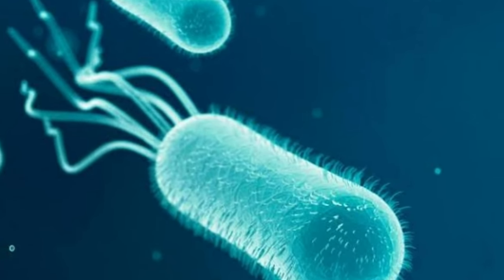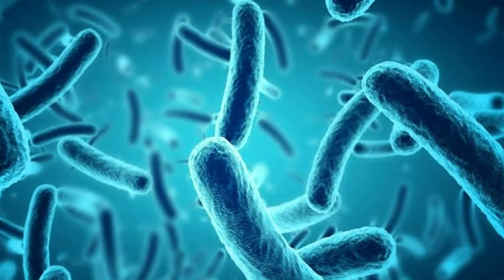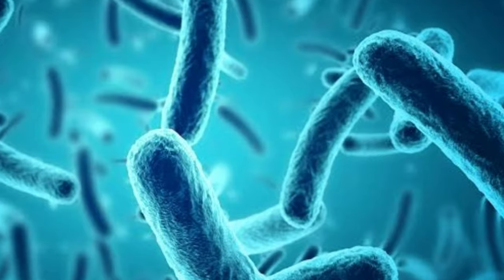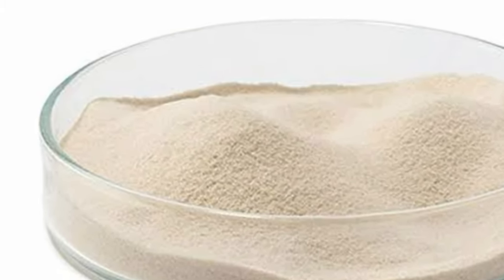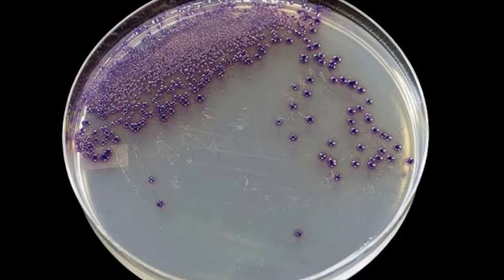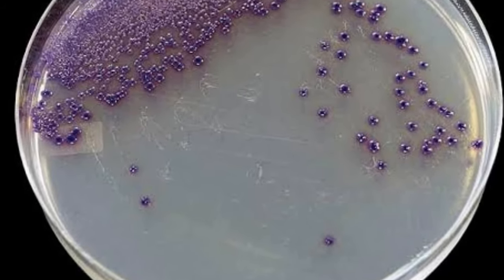Bacteria are the smallest living microorganisms which belong to the first kingdom of the five-level hierarchy classification. They can be easily grown on solid media using a substance called agar agar, and can often be grown on plates, as you can see here from the footage I've recorded.